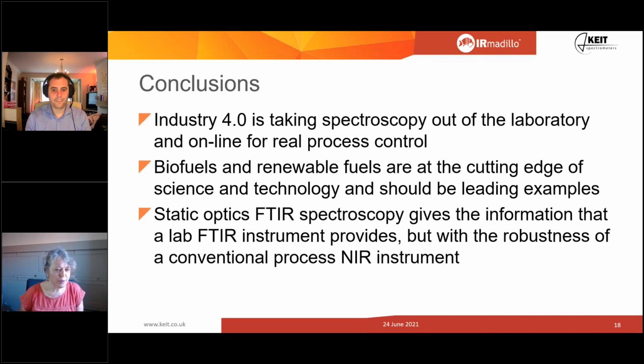Is ppm the typical limit of sensitivity for trace components? So normally I'd say yes. But this morning, and genuinely, I know it sounds like I'm making it up as I go along, it was genuinely this morning, we completed some work where we were looking at arsenic in phosphoric acid, and we got to 13 ppb limits of detection, which for spectroscopy and FTIR is amazing.